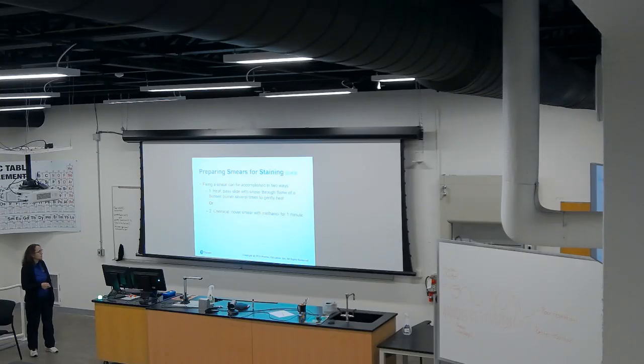And then the chemical fix will be with methanol for 1 minute. Or even sometimes you can use isopropanol. And you have to do one or the other. You cannot do both. Especially if you're using the chemical, don't think like someone will leave there the alcohol and then pass it through the flame. No, that will be terrible.